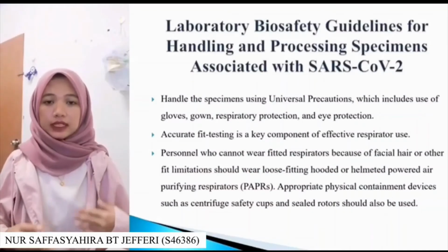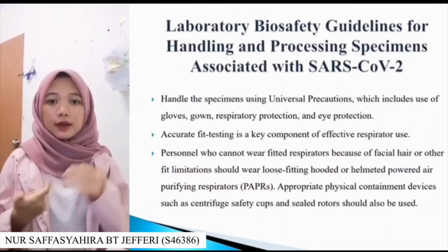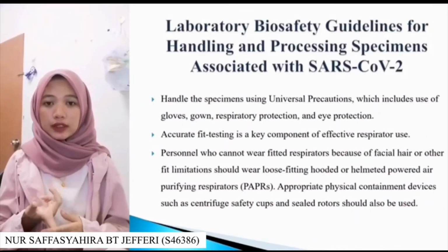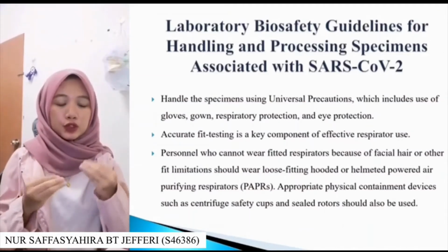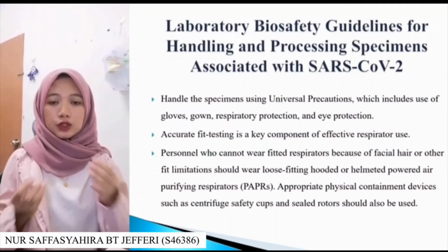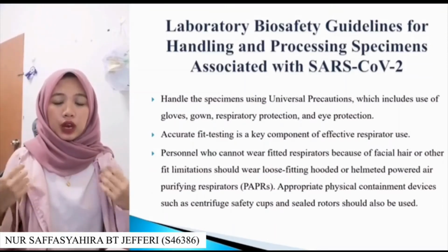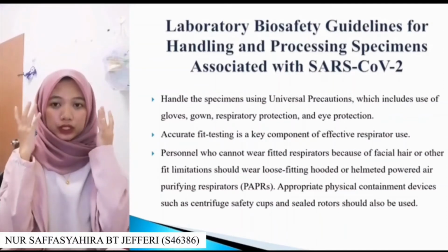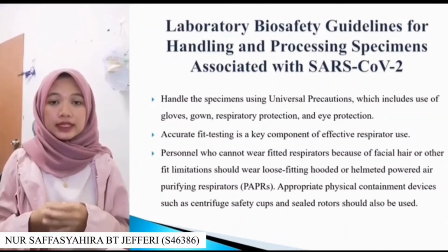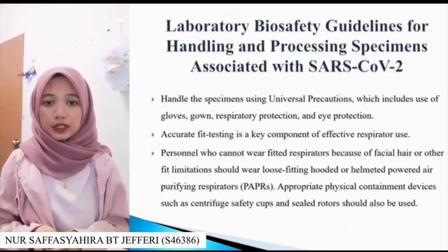Laboratory biosafety guidelines for handling and processing specimens associated with SARS-CoV-2. Handle the specimens using universal precautions, which include the use of gloves, gowns or coats, respiratory protection, and also eye protection. Accurate fit testing is a key component of effective respirator use.